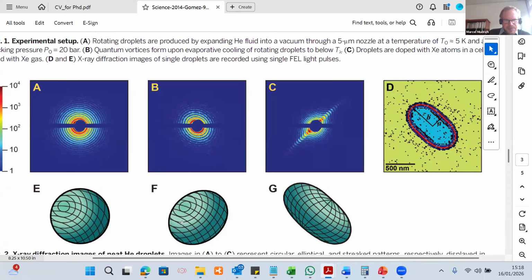Of course, when it becomes ellipsoidal, then also the diffraction image starts to change. But as soon as you get two flat surfaces that become parallel to one another, this slight change of the shape of the ball becoming flattened then manifests itself as this very elongated streak pattern.